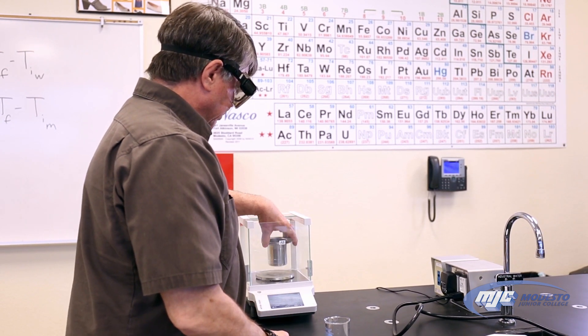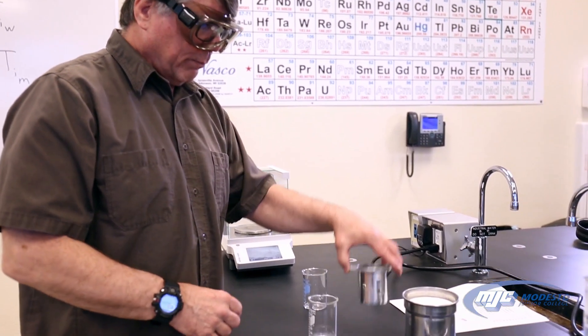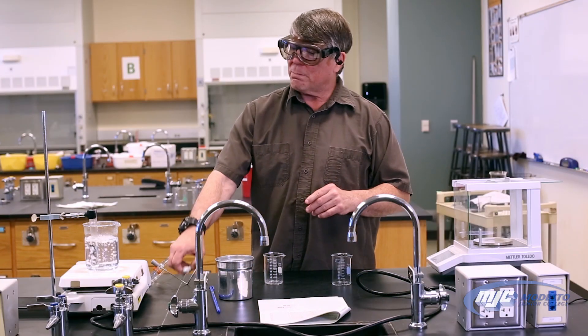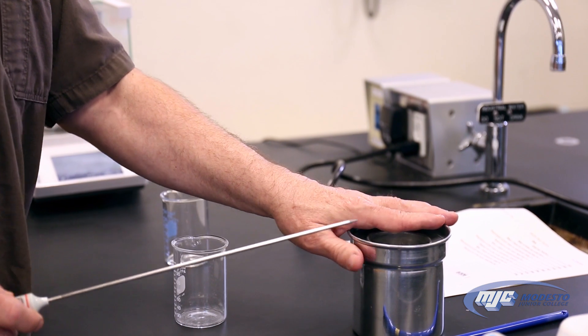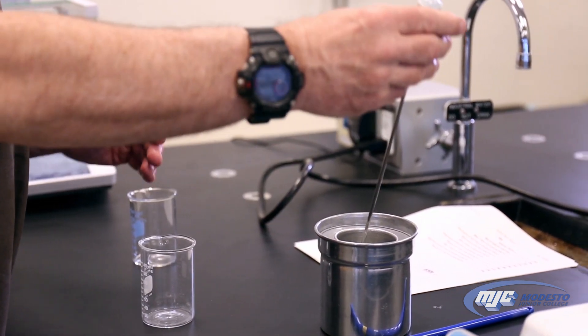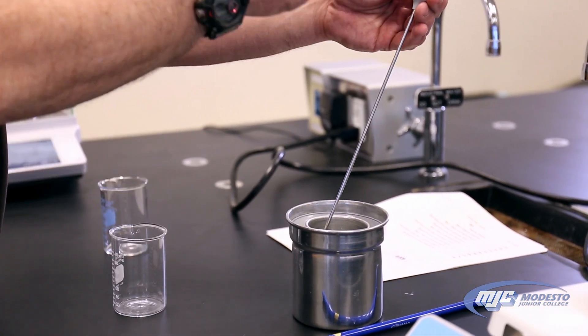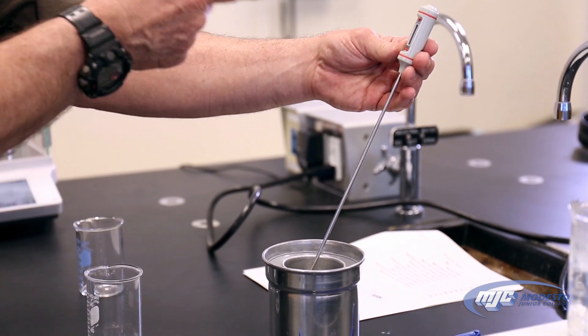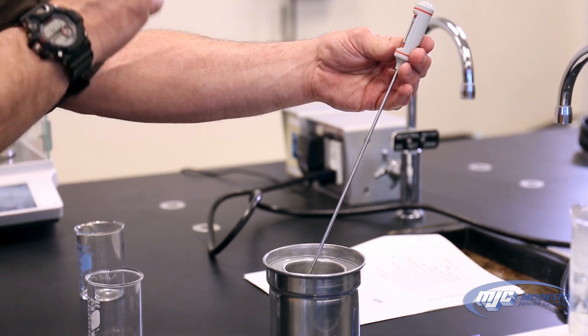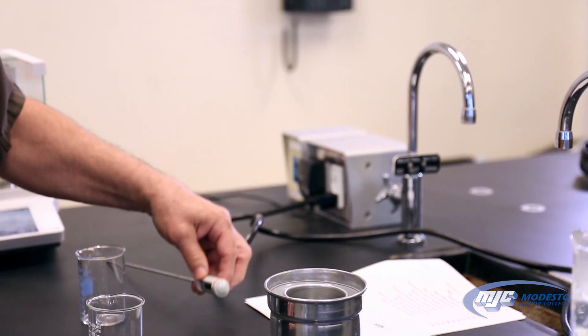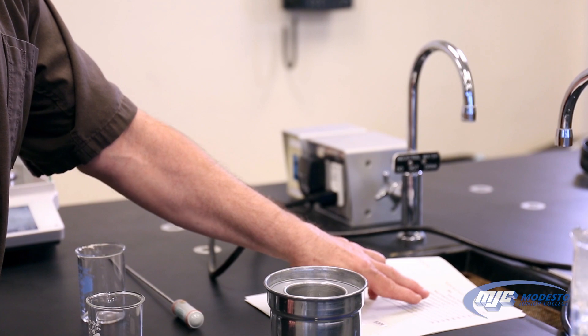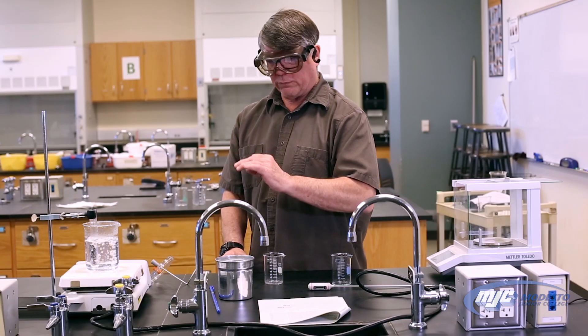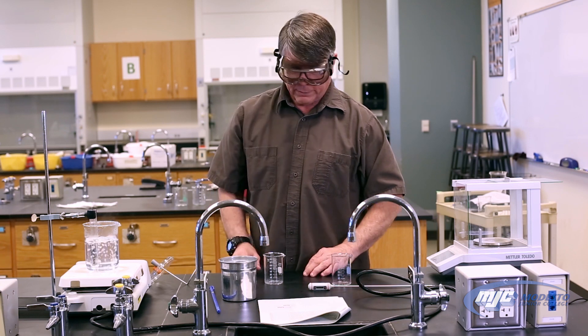So we take it out. Now place it back into the calorimeter. Now we need to know the temperature, the initial temperature of the water. So we take our thermometer, digital thermometer, it's on degrees Celsius. Hold it in there, let it come to equilibrium, read that temperature, one past the decimal degrees Celsius. That's going to be the temperature of the cold water in the calorimeter, A4, B4, C4. Set that there.